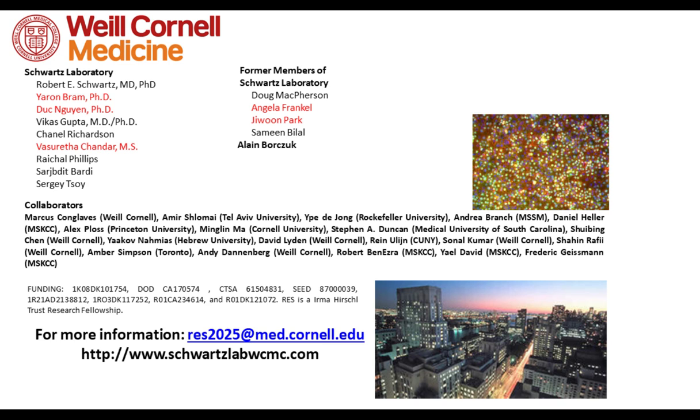Great. Thanks, Joe. Another question that came in also for you is, is there the ability to make custom assays for gene expression on nCounter as well as custom GeoMx protein and RNA assays?